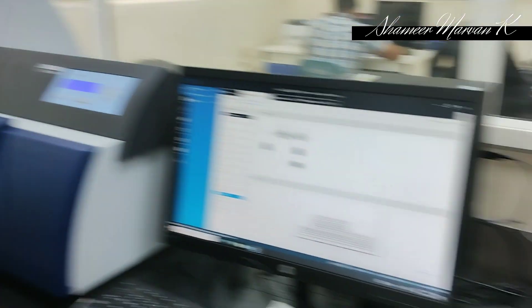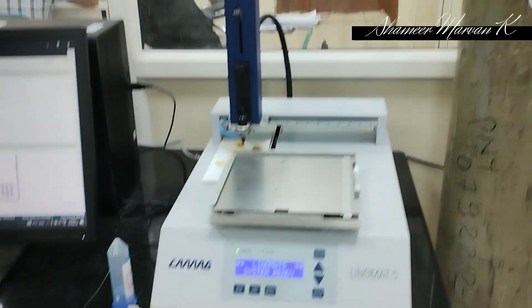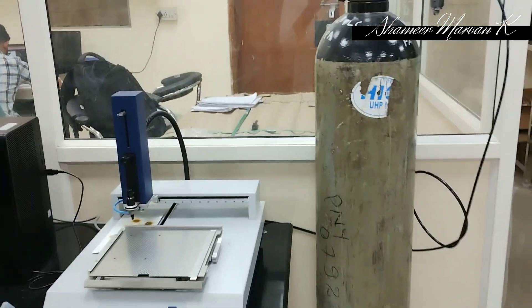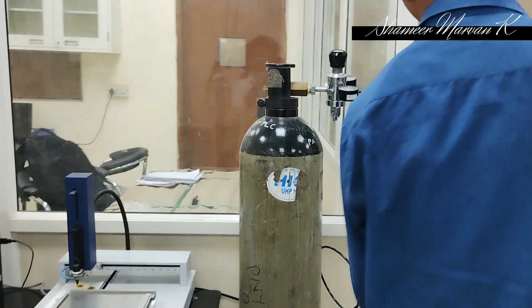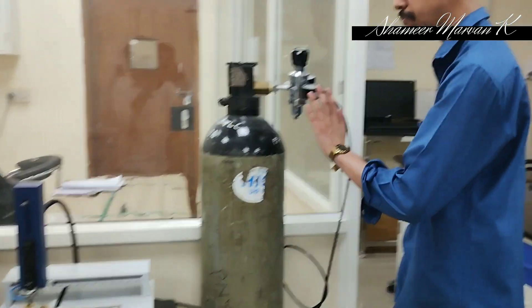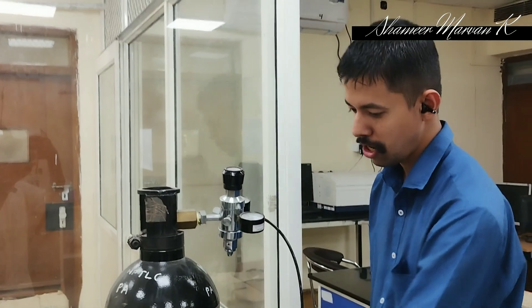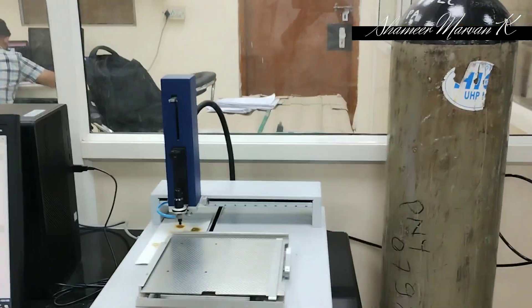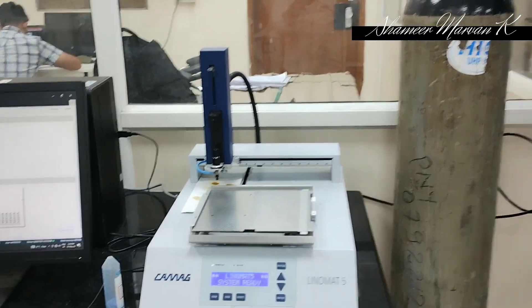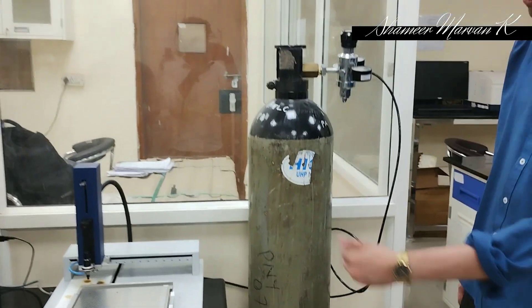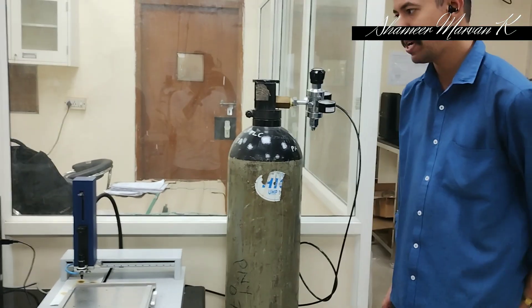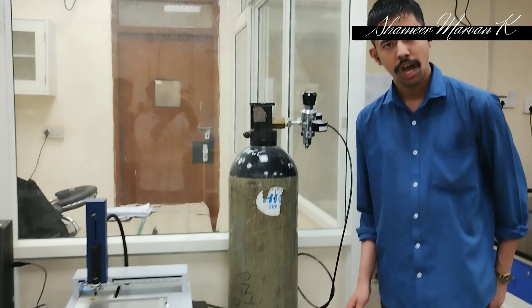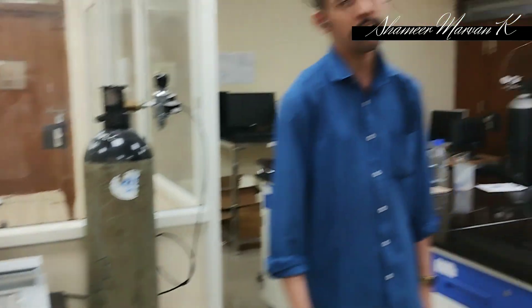This applicator is connected with a nitrogen gas cylinder. The cylinder applies pressure to the Linomat 5 applicator, and the application of samples is done using this setup.